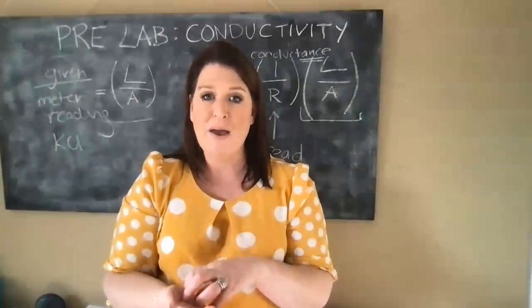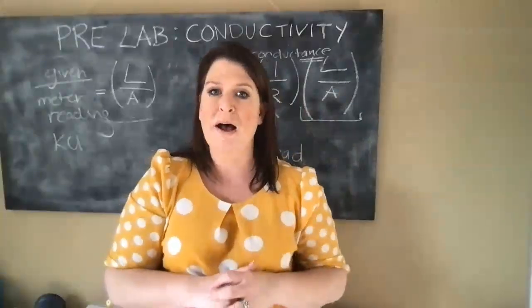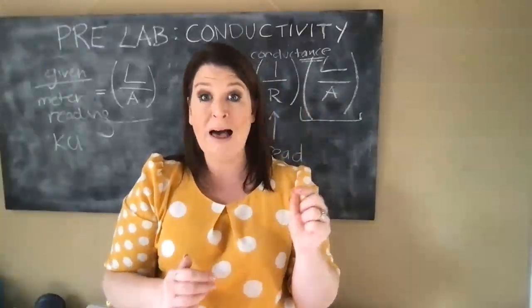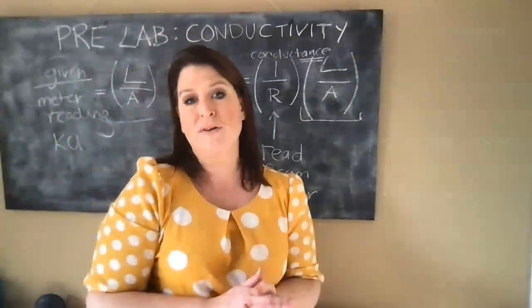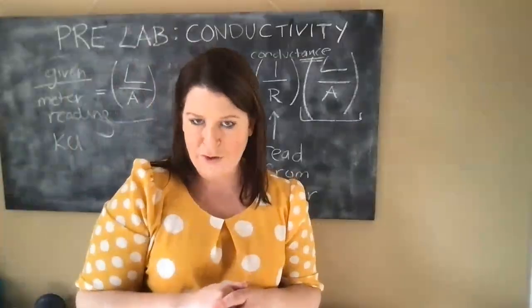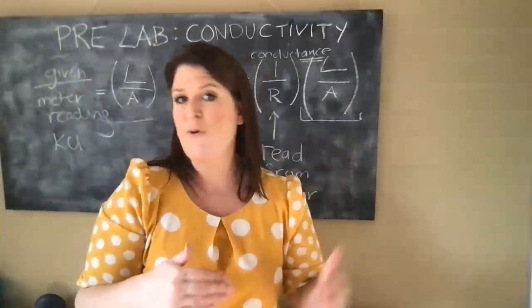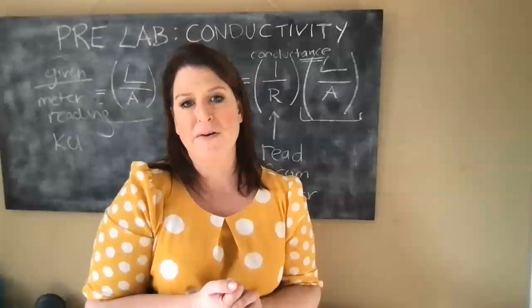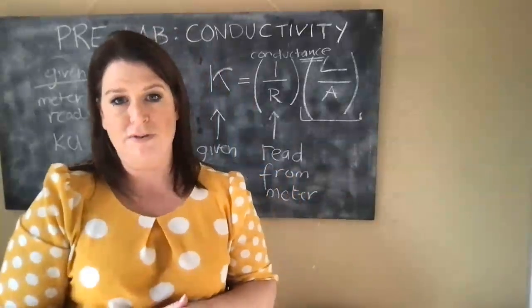So make sure when you make up your solutions that you get them straight away into the water bath. The probes you're using have a built-in thermometer with them, so make sure they're all within 0.1 of a degree of each other. If one is only 22 degrees and the other is at 25, you're not making direct comparisons of both on a fair and level playing field when you want to test the conductivity.